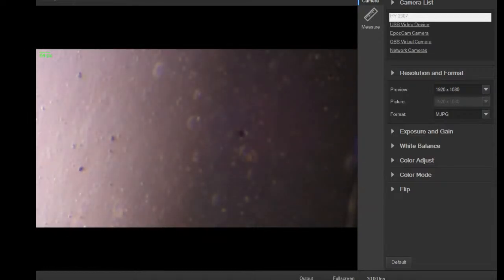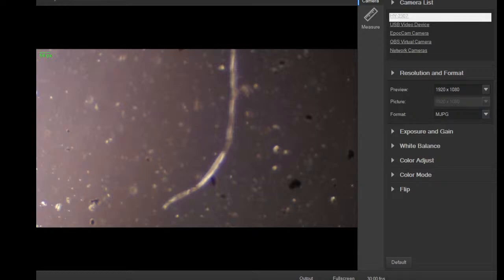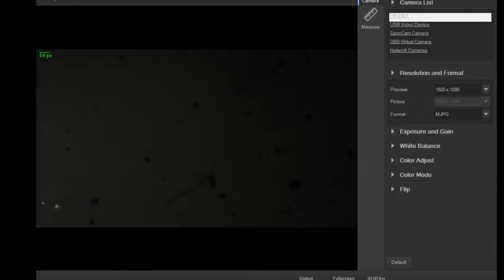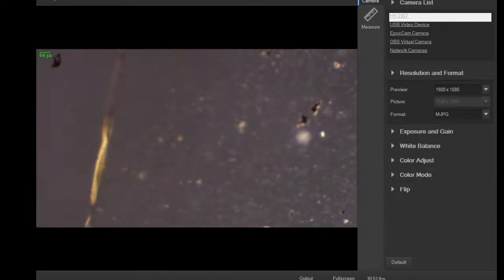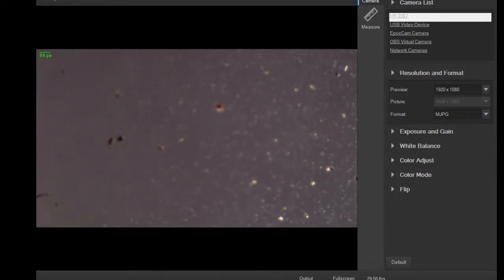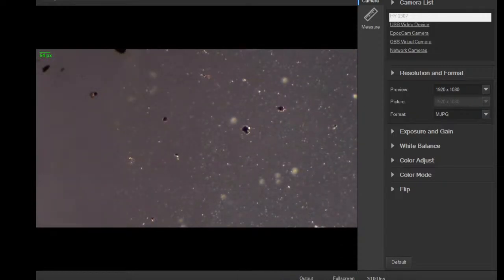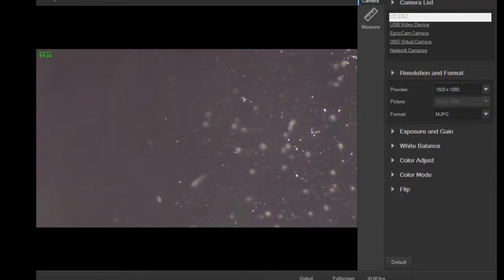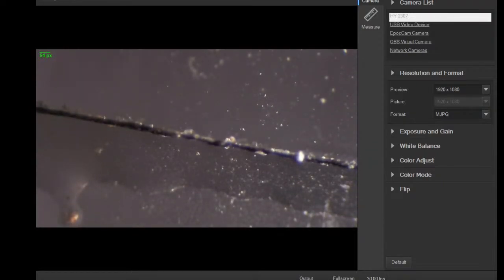Not seeing any. That's just particles moving. It's not a critter. I got some dark field over here. Just a little bit further. Some proper dark field there. Let's see, what do we got? Whole lot of mess. That's kind of fun. See little particles dancing around at the bottom there? They're kind of circling, like it's stuff swimming like plankton, but it's just a gradient.